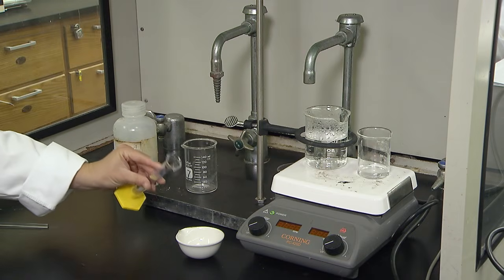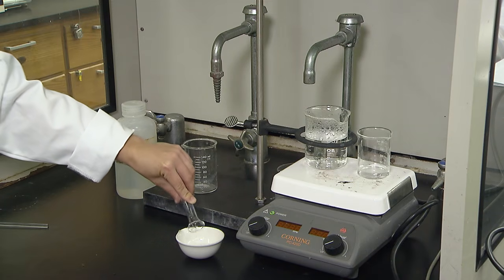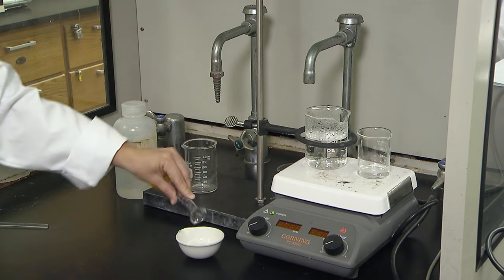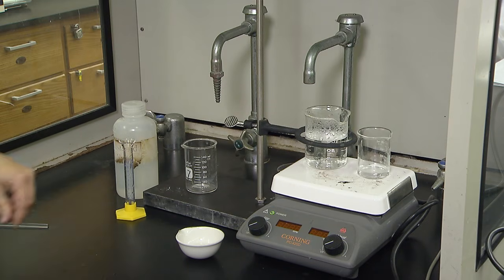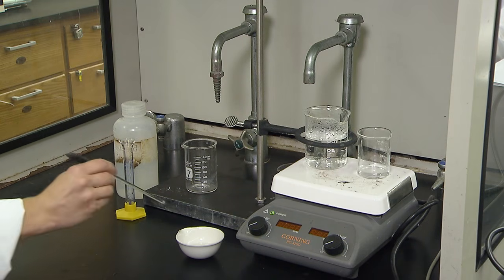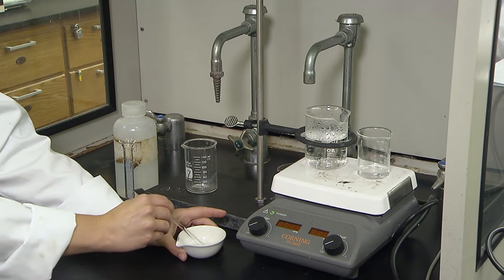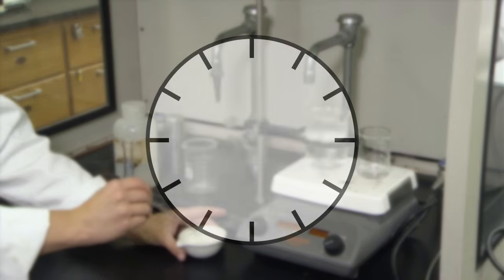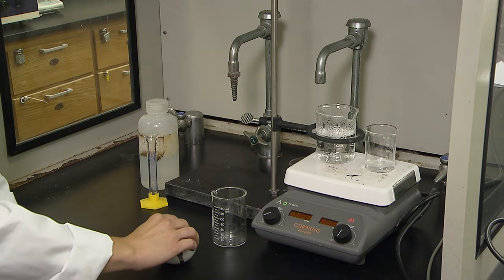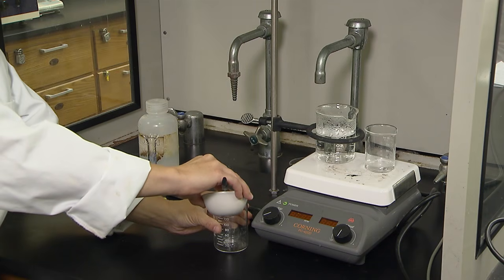Now react the 2 remaining solids with 8 milliliters of hydrochloric acid to separate them. Use caution when handling acids as they are corrosive. Pour slowly to control the rate of the reaction. Let the solid settle to the bottom of the evaporating dish. Decant the supernatant liquid into beaker 1.